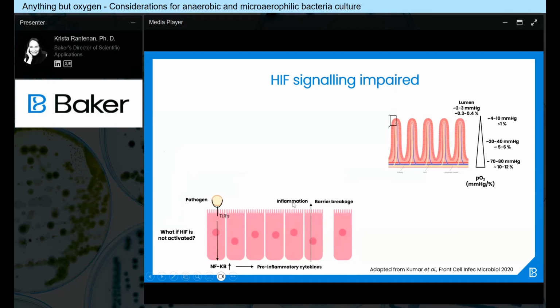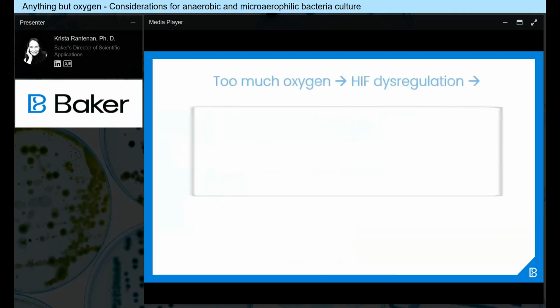So this is what happens if we study the activity of microbes on cells in conditions that are not mimicking the oxygen atmosphere of the gut. So it highlights the importance of in vitro experimental conditions, because it's not only the bacteria component that is affected by oxygen levels, the human cell component is heavily affected by it too. So that's the problem.